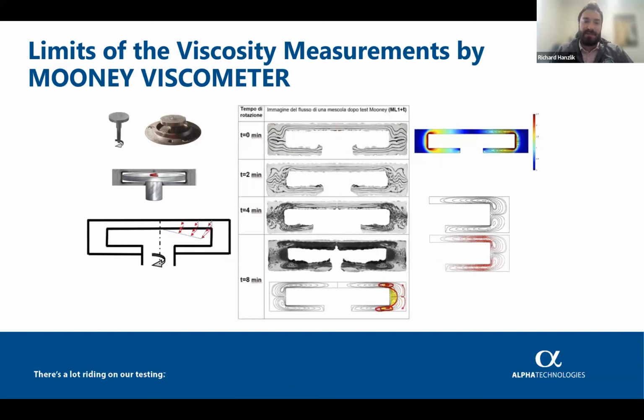And then Mooney viscometer is kind of a staple of the rubber industry. This is, again, a quick and dirty test to look at processability. Typically, you'll run an ML1+4 or ML1+8, which is a 5-minute test or a 9-minute test, where we're just measuring viscosity of the last 30 seconds of that time frame.